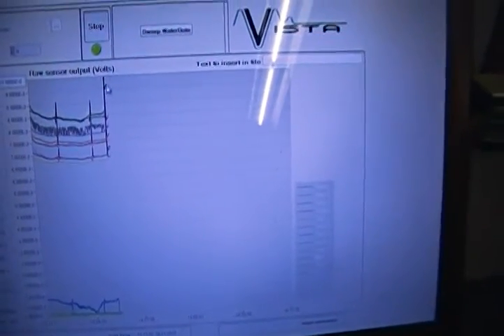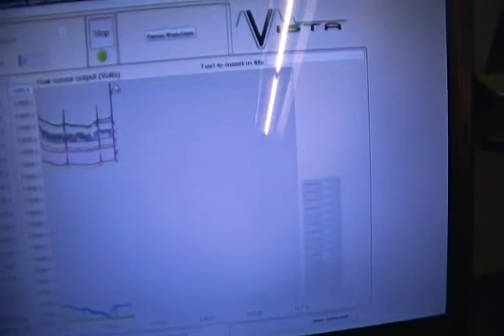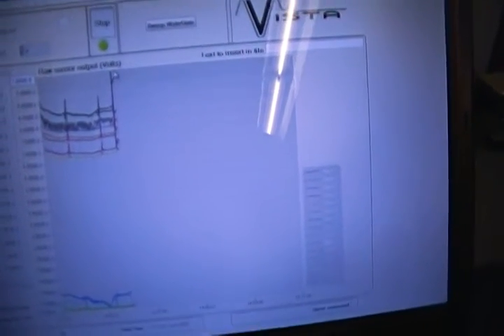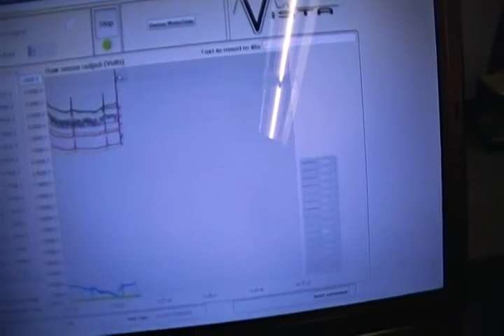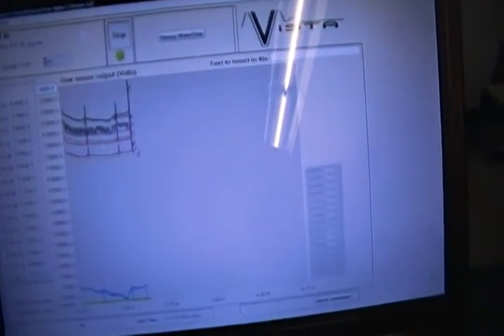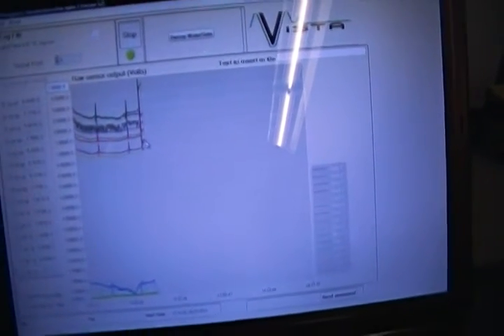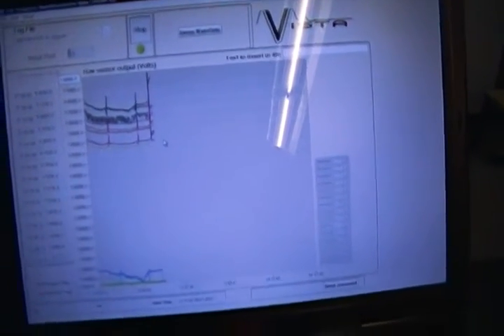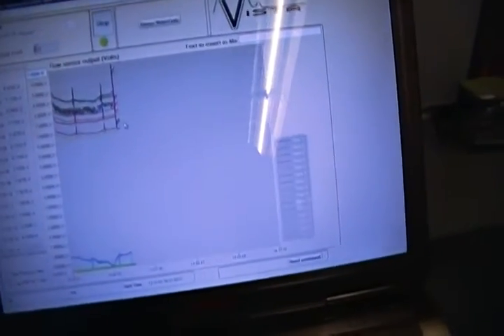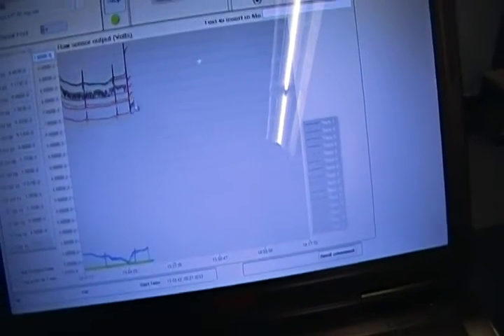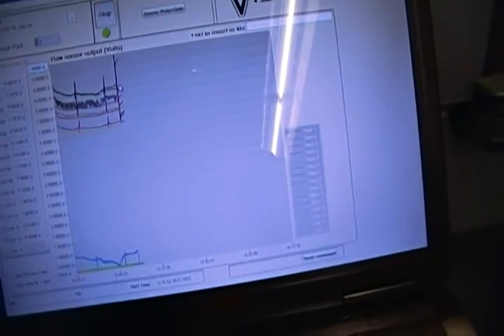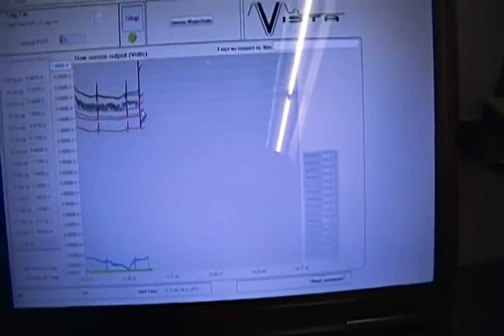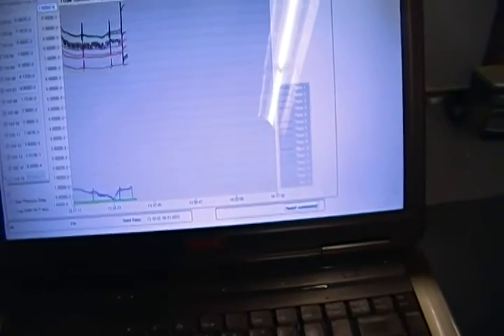is this is fibronectin now binding to the aptamers. What we'll see in a moment is that not all of the nanowires respond because some of them have been functionalized to a different protein, that is Hsp70. And so, for example, this blue trace represents one nanowire. It's not responding to fibronectin, whereas most of these are responding. In a moment, we'll add Hsp70, and we should see this nanowire responding. Let's see if there are any others that we should be looking at.